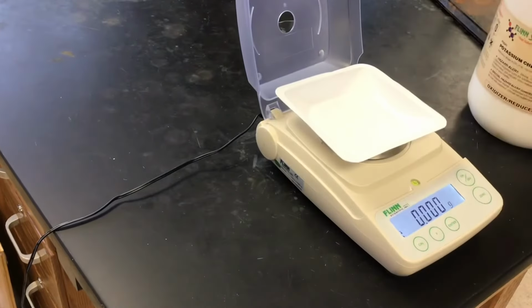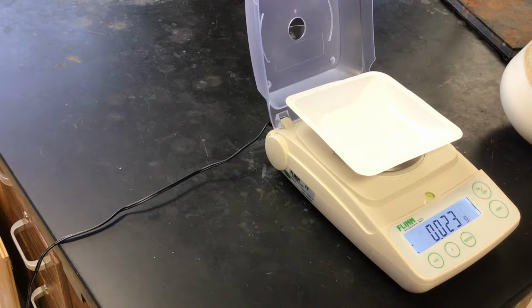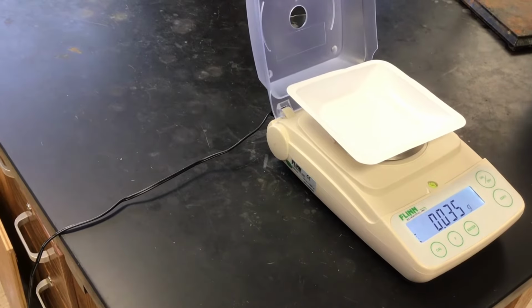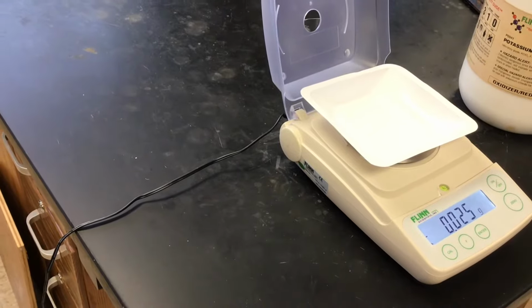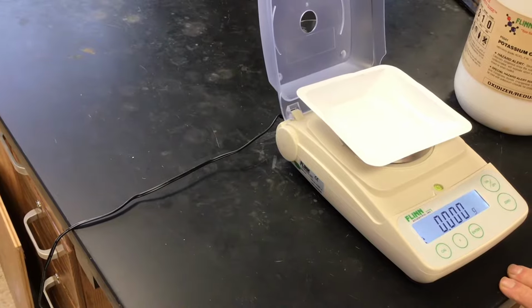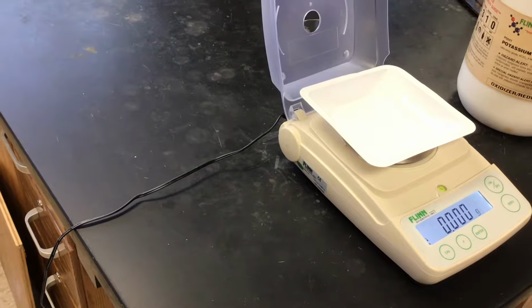Balance zeroed in here. That balance is being stubborn. It's jumping all over the place. Yeah, this one goes out to the thousandths place, so it's pretty sensitive. Can't breathe on it. Okay, seems like it's pretty stable.